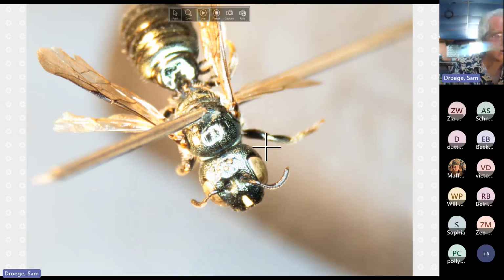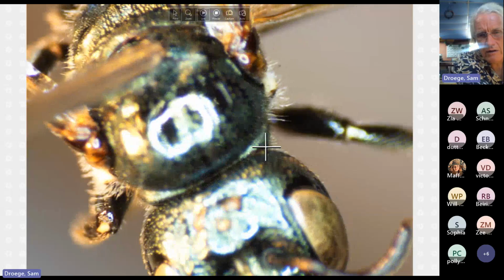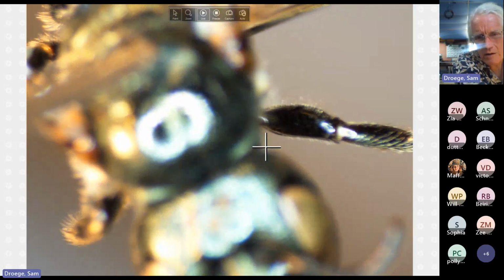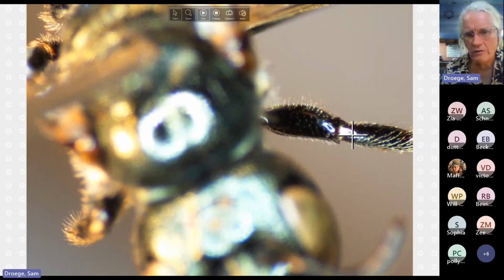Oh, look, here's our area on the femur and tibia, and we'll see the alternative mark here, although there's a little bit of reflection associated with this. These are reflections. This, I believe, is the mark right there.